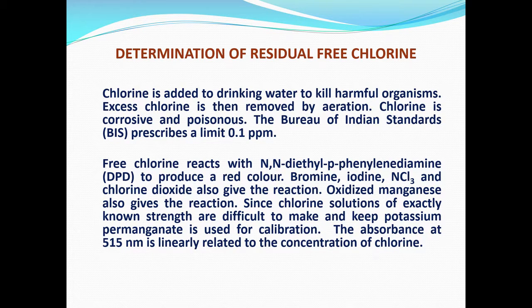Of course, there are other methods of determining arsenic, such as the Marsh test, which is the conversion of arsenic into arsenic hydride. That arsenic hydride can be dissolved in water and then treated with a triphenyl methane dye with a spectrophotometric finish at ppb level.